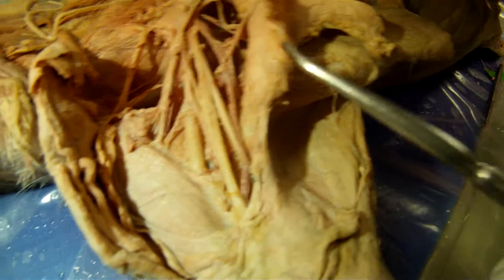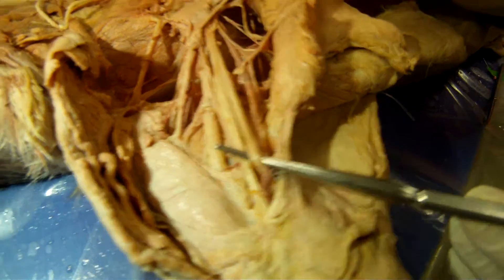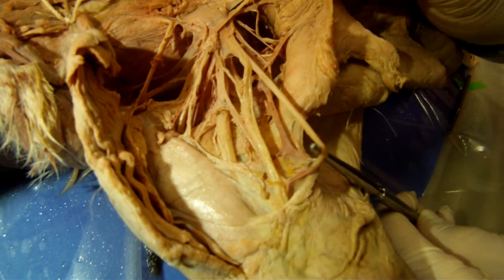Pull on the ulnar — you can see the M pretty good when you lift it up towards you just a little bit. There's your M, so there's your landmark.